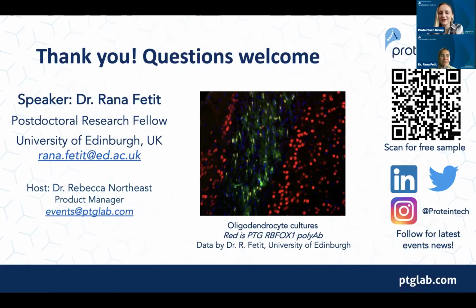Yeah, I understand. And then one question is, are you able to produce different types of oligodendrocytes from different regions of the brain? So in culture, we have looked into different markers from the reported papers, and we found that in culture, they do not express one specific type. They lack the extensive cues. So you would have oligodendrocytes, but not a specific subtype, because I think it's just about how far along the maturation line they are at that time point. So yeah.